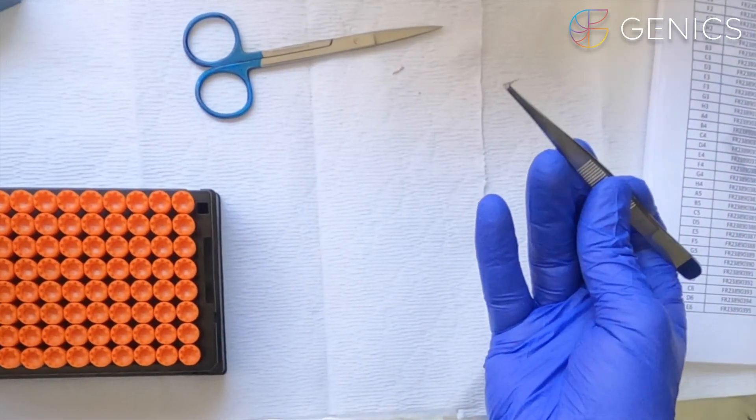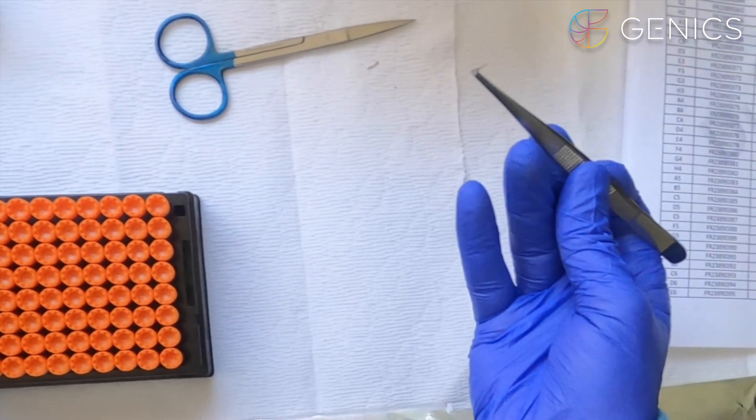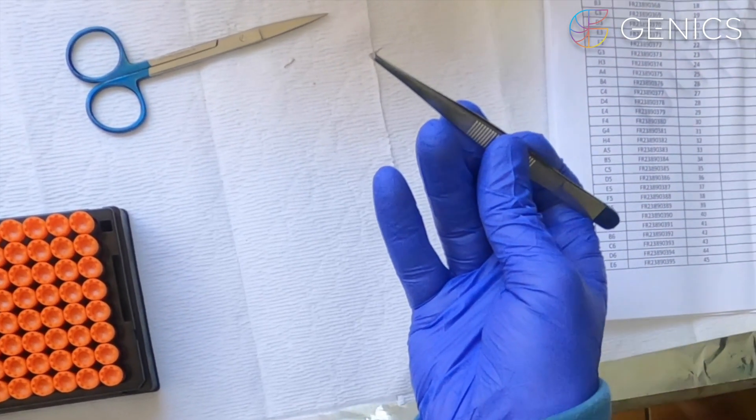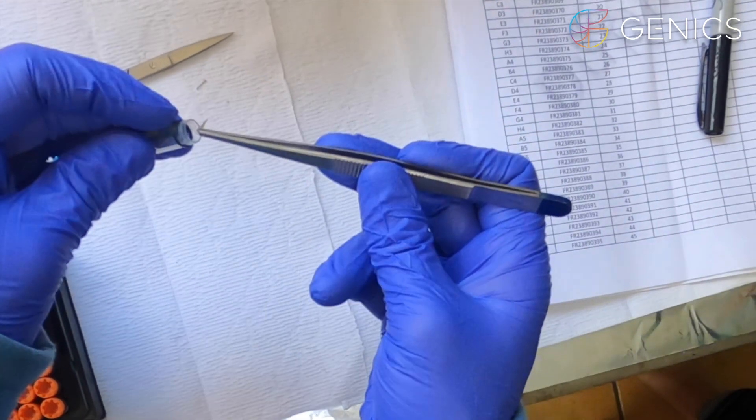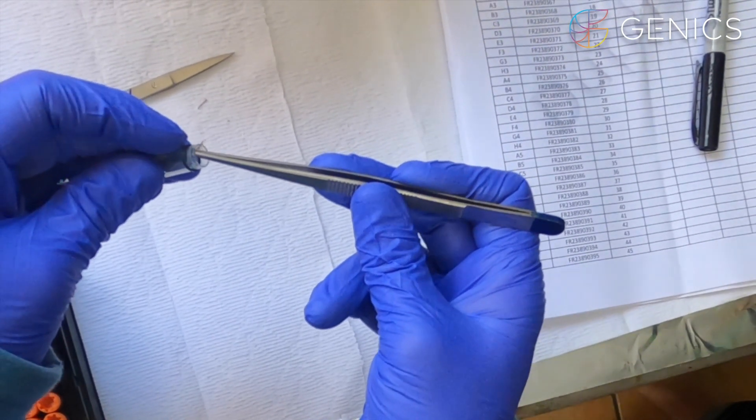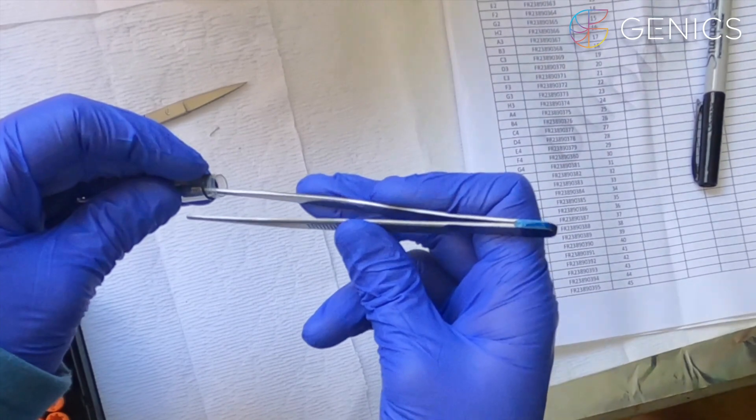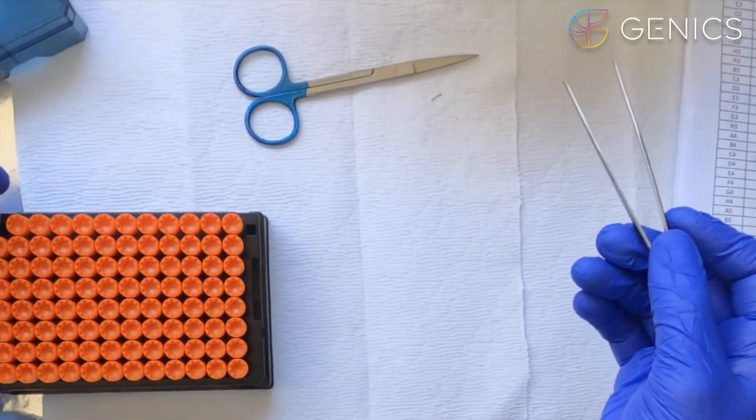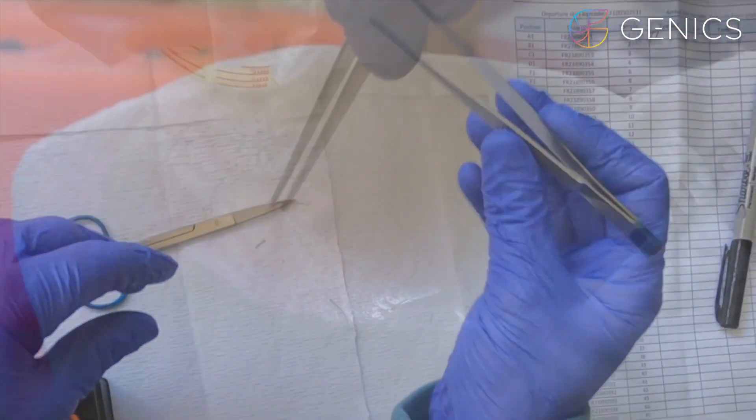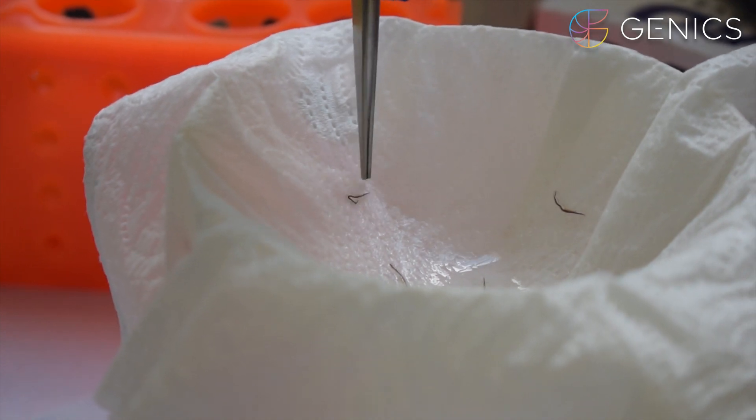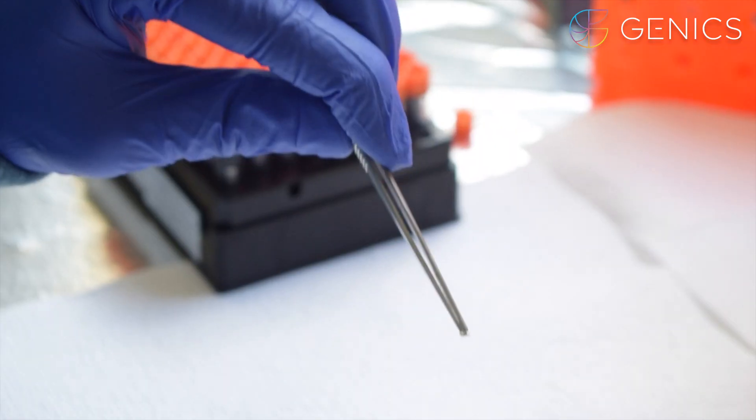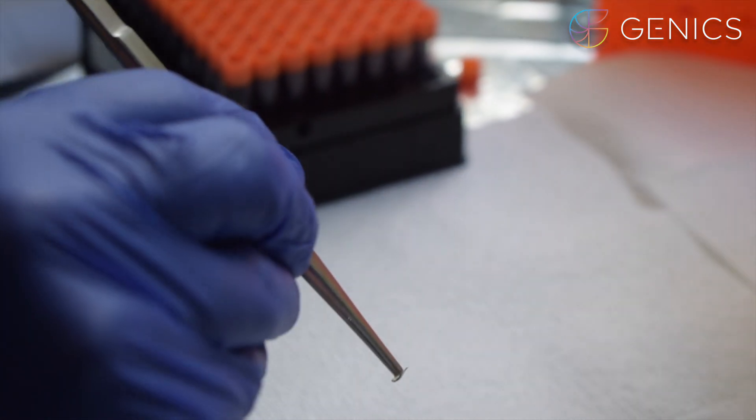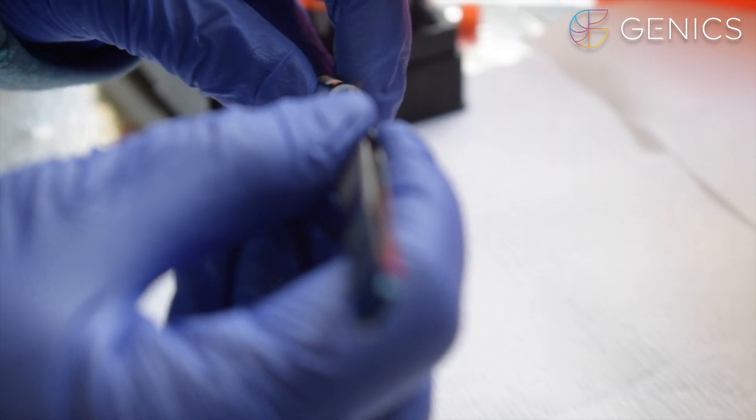We then put our shrimp head into our barcoded tube which already has our 70% laboratory grade ethanol. We're going to put a total of 15 heads in this same tube. When we're doing a pooled sample we don't need to sterilize our scissors and tweezers between heads which are going into the same tube.